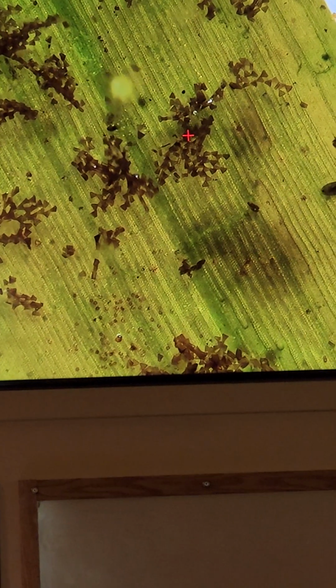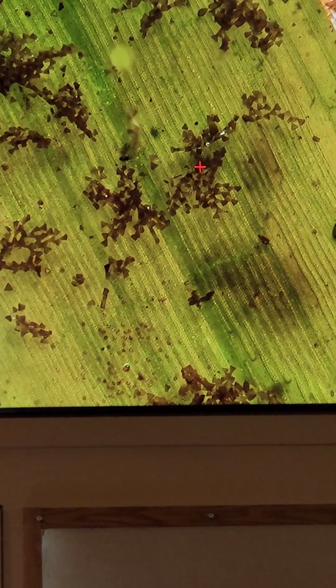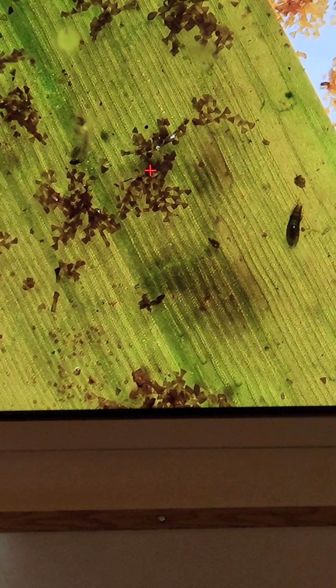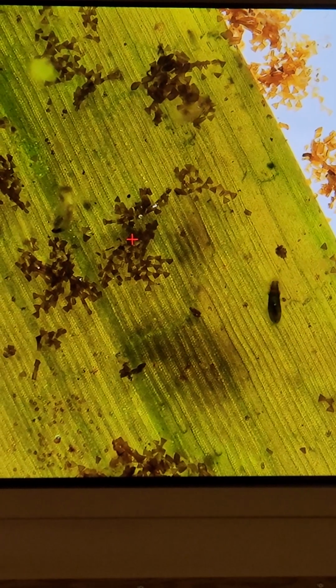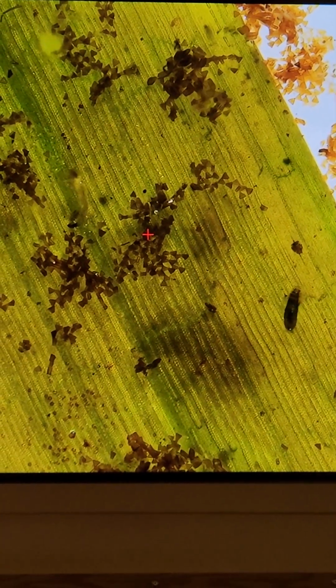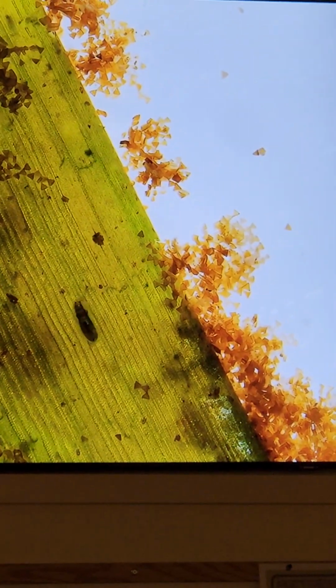What are they called? The caprellids. Skeleton shrimp or caprellids is what they're better known for. Awesome. Transparent. Yeah, they are. Sometimes if they're hanging out on the very side of the eelgrass, you can see them a lot better. But obviously they're very good at their camouflage. And he's snacking on some diatoms right now, which is really cute. What is the name of the diatoms? Triceratium. And the individual ones are triangular. Yes, that's the species name.